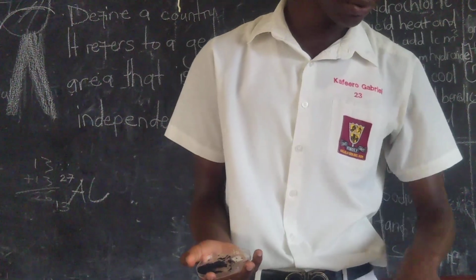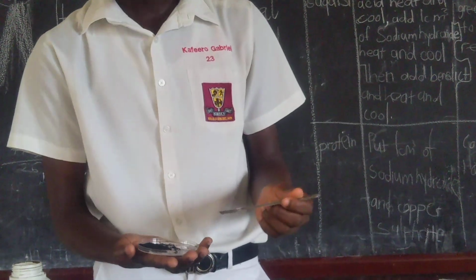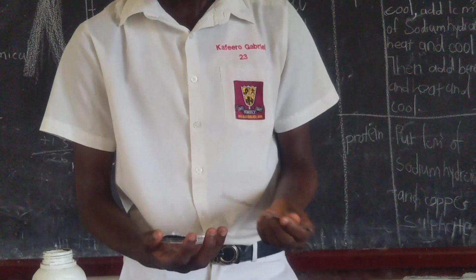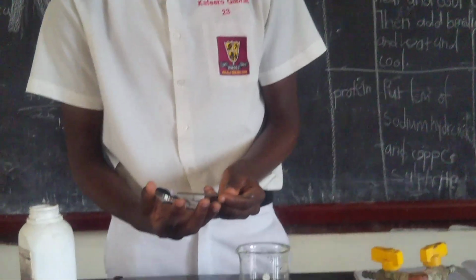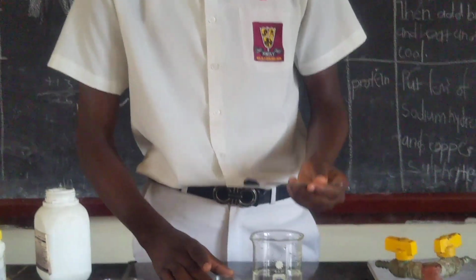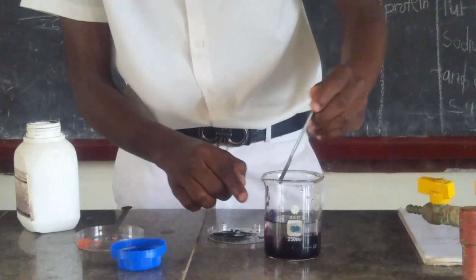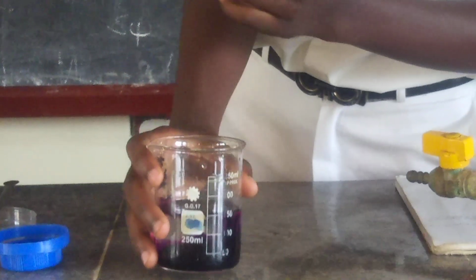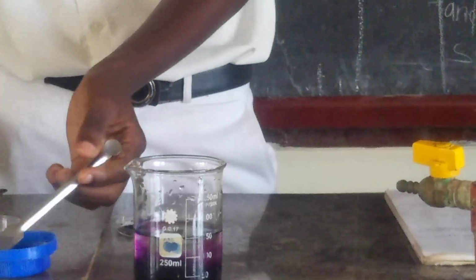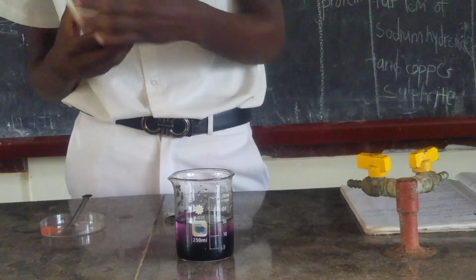So as our second step said, let's do it. I use the flat side so that I can scoop this potassium permanganate into our beaker containing water. So this is it. Remember, it's black in color, so we shall see the results after adding it to the water. So here it is, then it's added to the water. As you can see now, after adding this potassium permanganate to a beaker containing water, this is our result. Because the experiment is not yet done, we need to finish it.